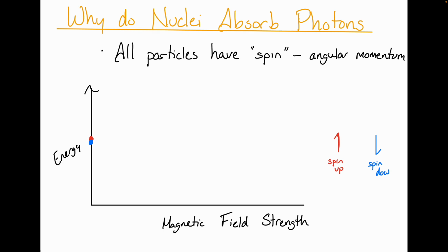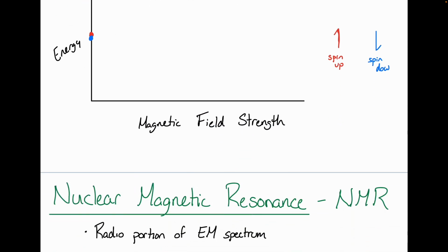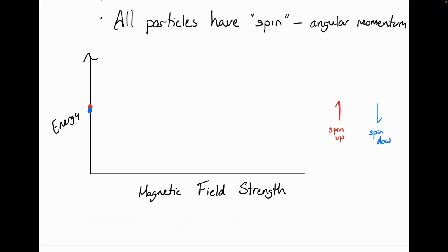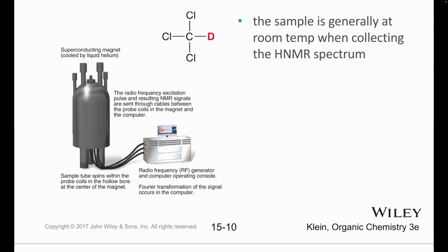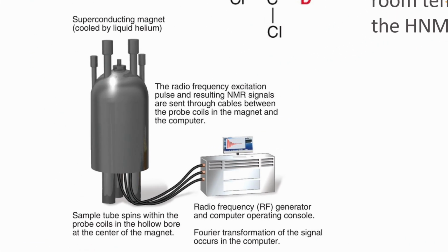All right, but one key component of NMR, one thing that makes it so difficult to use and so expensive, is you have to have this gigantic magnet as part of your machine. If you've ever seen an NMR, especially one of the large ones, they can be like the size of this room, kind of. Just this giant barrel. We have a picture. All right, it's like this giant barrel here. And what's inside that barrel is a humongous magnet, creating this really strong magnetic field. And you stick your sample right in the middle of this giant magnetic field.